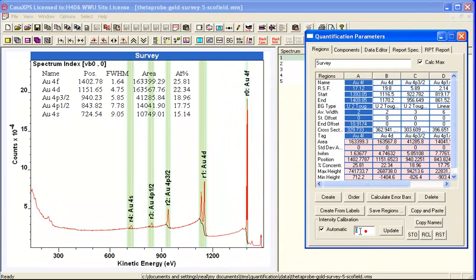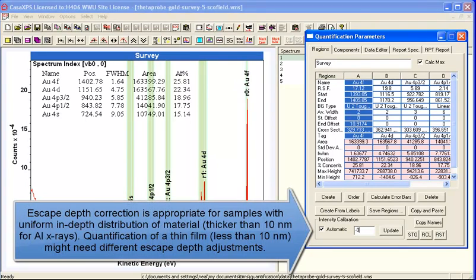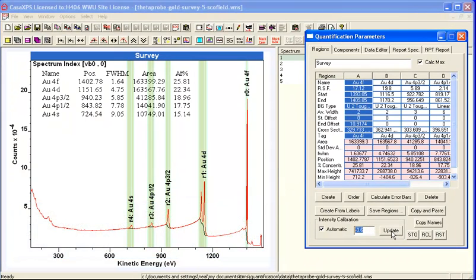Hence the importance of using an escape depth correction. To enter an escape depth correction, you enter a value and then you have to press the update button before this table is updated.